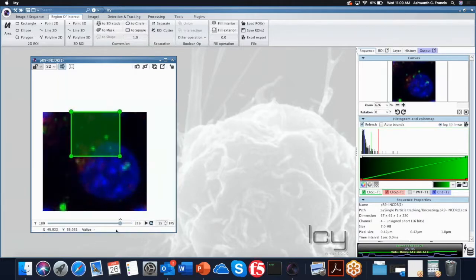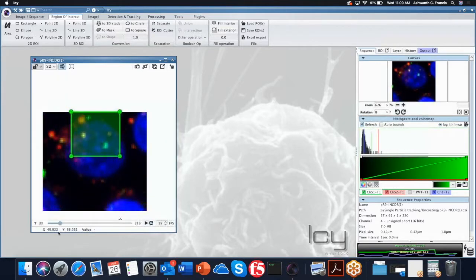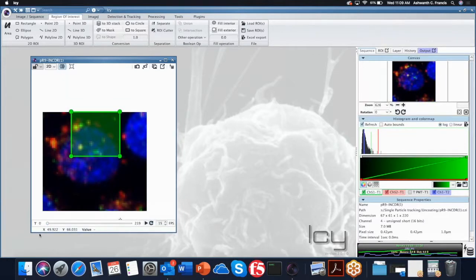Did you see what I did just now? Yeah? Got it? Did you guys get the virus, whichever virus you want to track? There are a few of them there. You draw a region where you can see them throughout the movie, right?